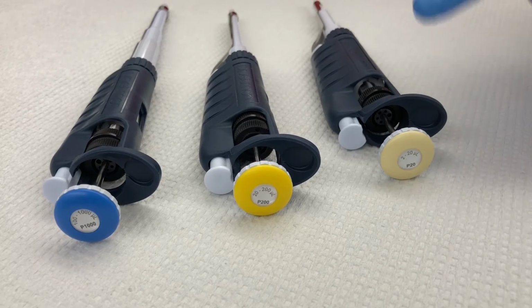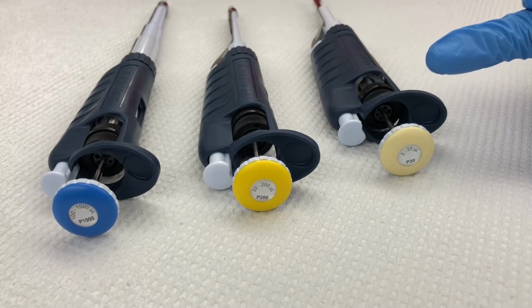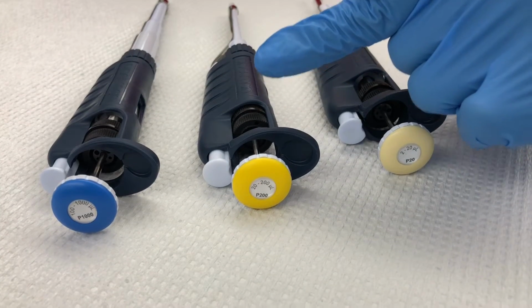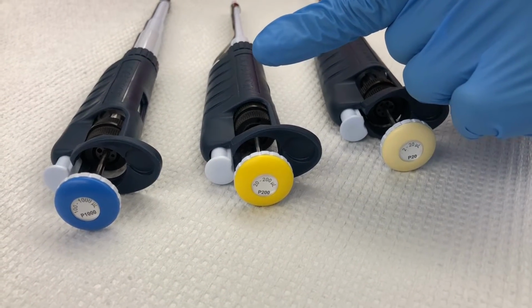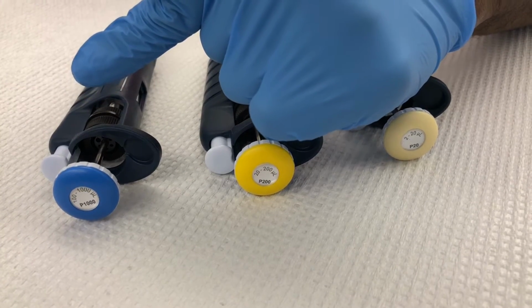For example, this is a P20. It is used to measure ranges from 2 to 20 microliters. This is a P200. It is used to measure ranges from 20 to 200 microliters. This is a P1000. It is used to measure ranges from 100 to 1000 microliters.